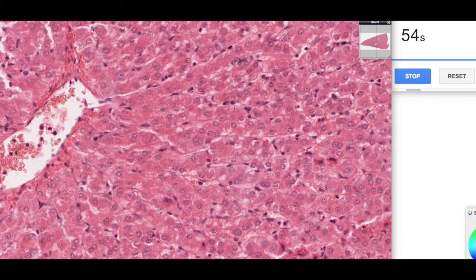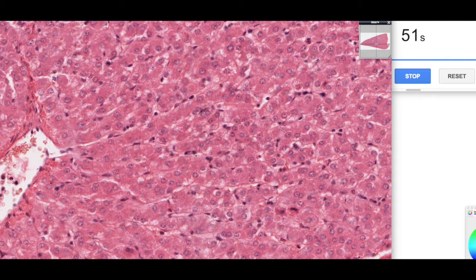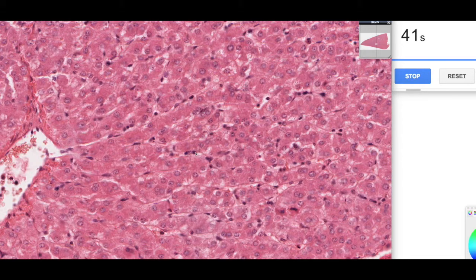The other cell type found within this region are these more rounded nuclei — these are the Kupffer cells, the resident macrophages of the liver. They are there to gobble up anything that shouldn't be there: microorganisms and aged red blood cells, which they can remove in case the spleen is not working properly, for example.